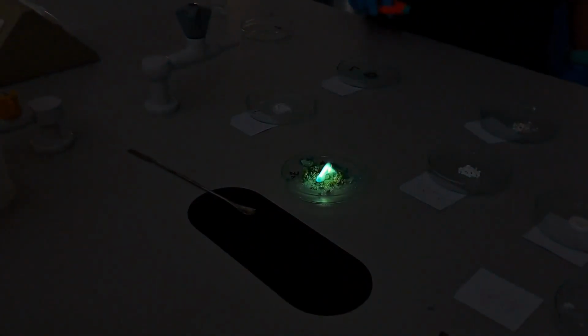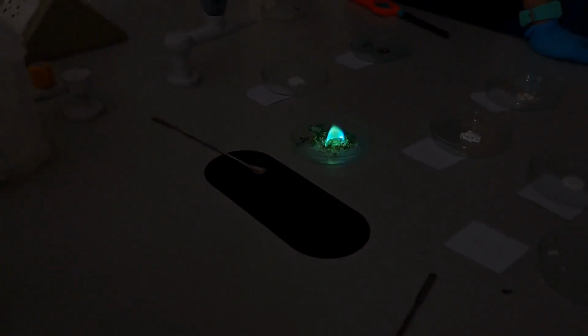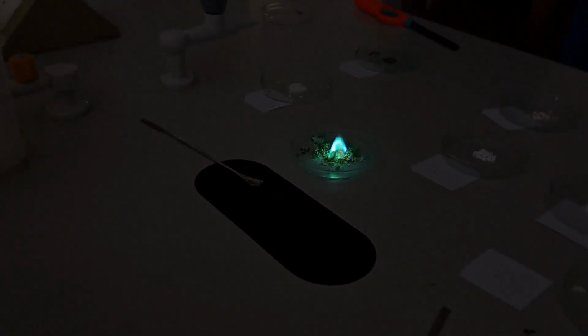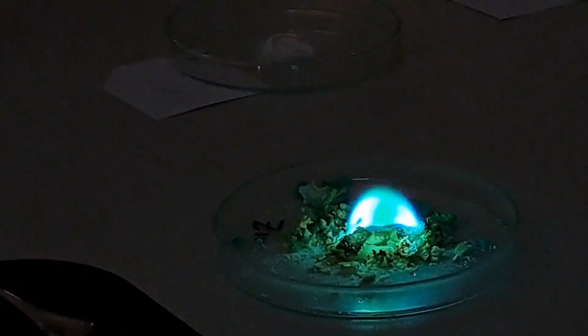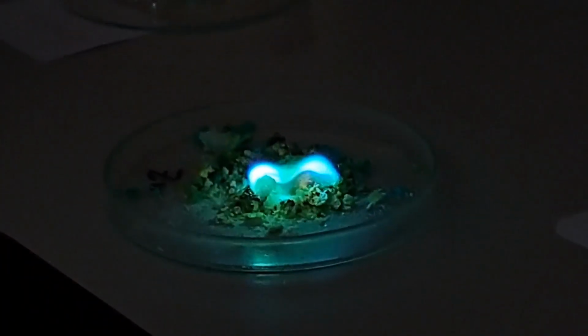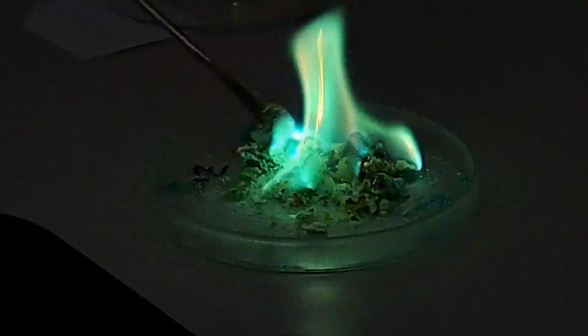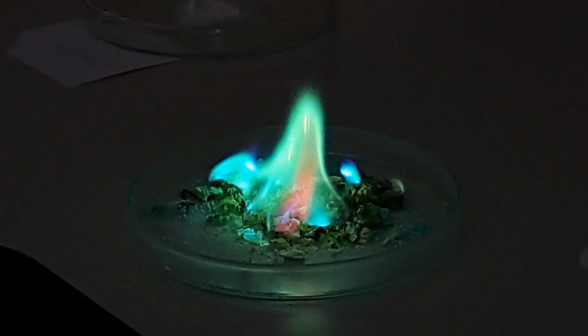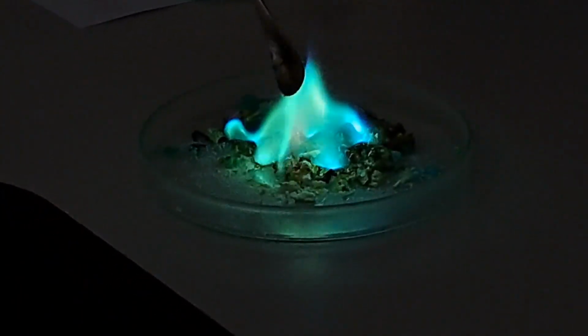Wow, everything mixed together. Don't let it go out yet. Oh, copper is the majority. Yes, it's so pretty. Wait, that's good. That's blue. Where does blue come from? A mixture. Blue is the primary color, like the pink. Where's the pink? I mean, the mix of pink becomes blue. That's orange too. You see a little pink there.